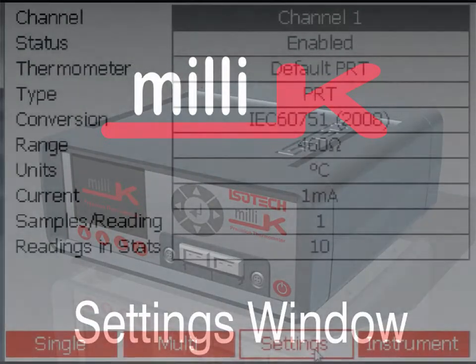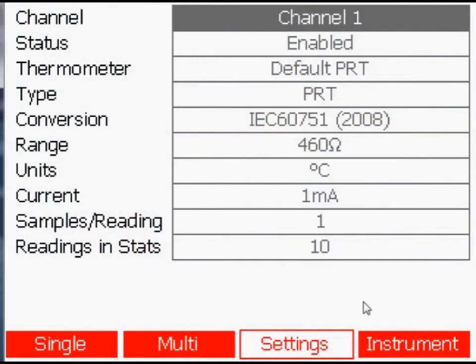Settings. In the settings window, you can change the settings for each measurement channel.